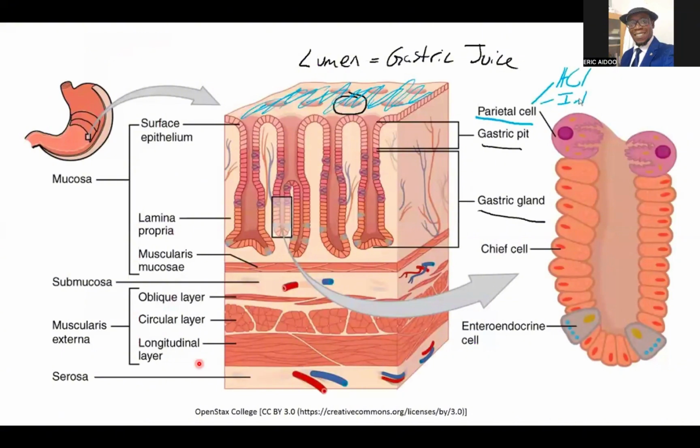It is always nice to look at drawings, and as I tell my students all the time, for histology, we deal with micrographs. The drawings make things simpler, and we try to understand it from the point of the drawing, and then we juxtapose it to the micrograph. So let's look at this and see whether we appreciate this even better.